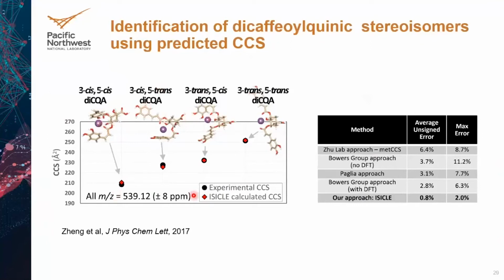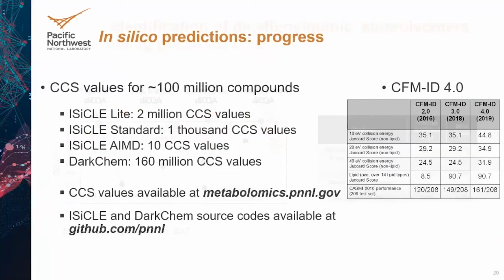but using ion mobility, and in this case, this is data from structures for lossless ion manipulations that I didn't provide much background on, but it's a very high gas phase resolution technique. And you can see the predicted values of these cis-trans isomers agree very well with the experimental values. And in fact, we observe around 0.8% average error compared to the experimental data. But again, this was with the most accurate version of our quantum chemistry pipeline that takes a long, long time. So we tend to accept higher error and use the higher throughput techniques to generate our reference information.